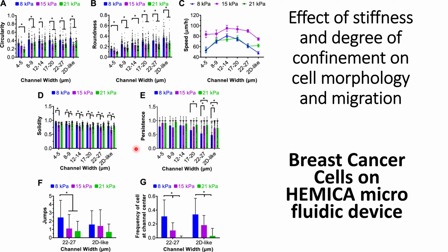And they checked the persistence at the different channel widths.